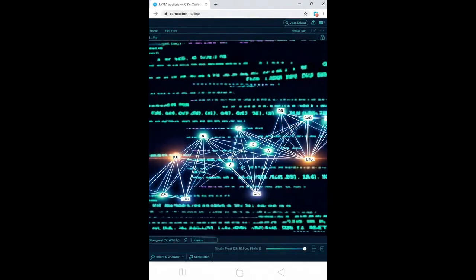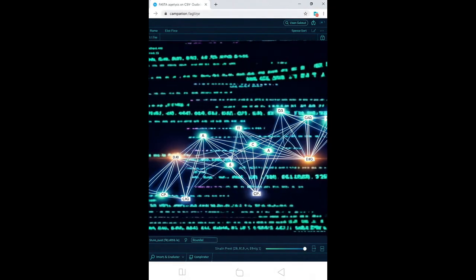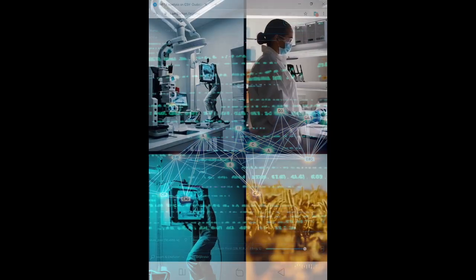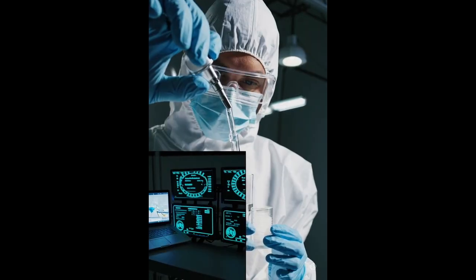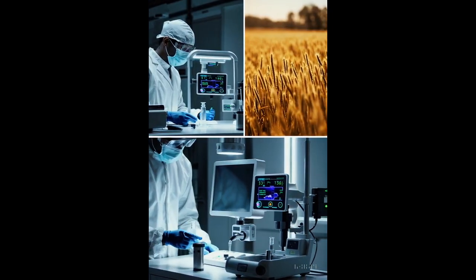iSignify uses a fast, on-the-fly K-mer comparison engine to identify signature regions found only in your target genome. It automatically pre-processes messy genome files, merges contexts, and aligns background genomes, all locally on your device. Then Google's Gemma model steps in to explain the results, translating raw numbers into clear summaries you can actually understand.